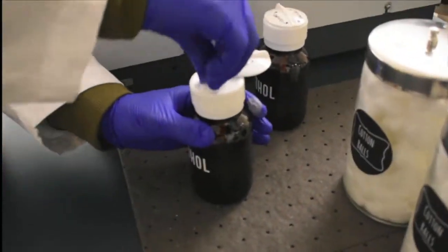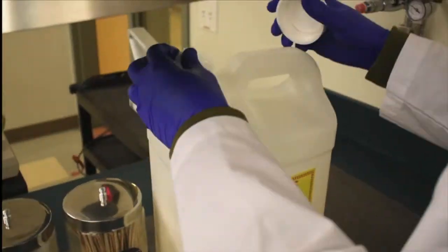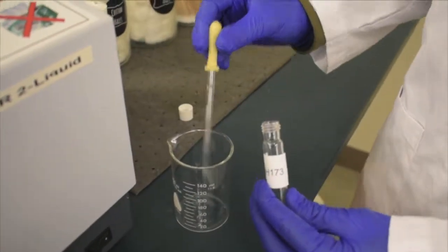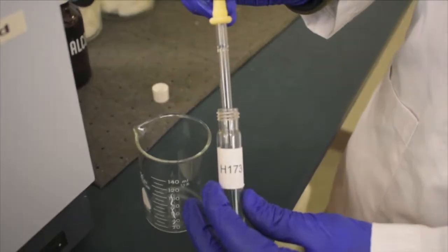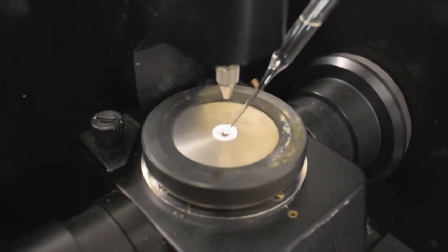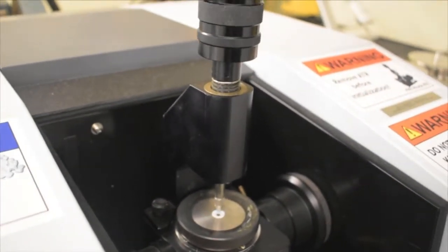To scan your liquid sample, you'll first need to clean the loading tray again. Use the Pasteur pipette to transfer your sample onto the loading tray. Rotate the knob again, making sure you hear a single loud click. At this point, you'll use the Spectrum program to scan your sample using the same steps as shown earlier.